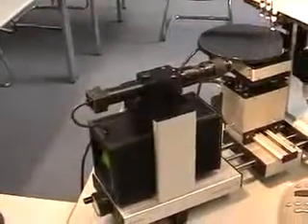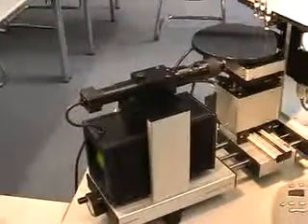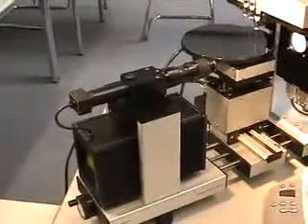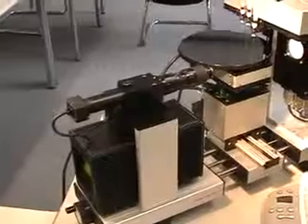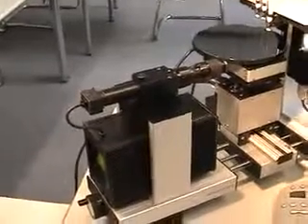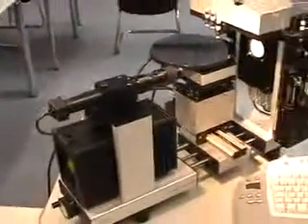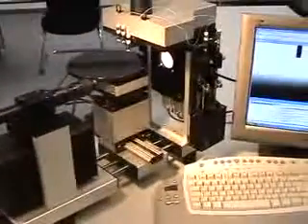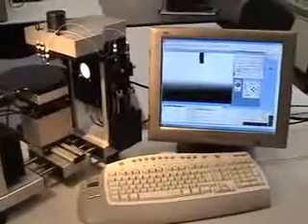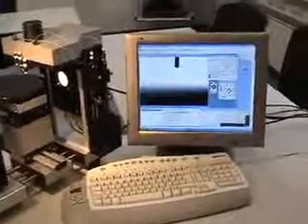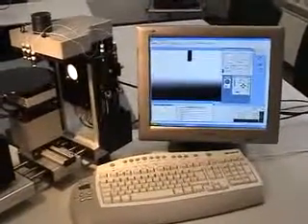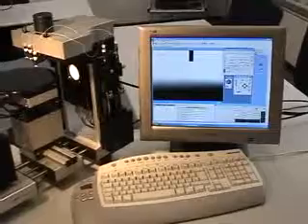Here we have the electronic box mounted on top with the optics, a CCD camera, and all of this is connected to a computer system running Windows 2000 or Windows XP.